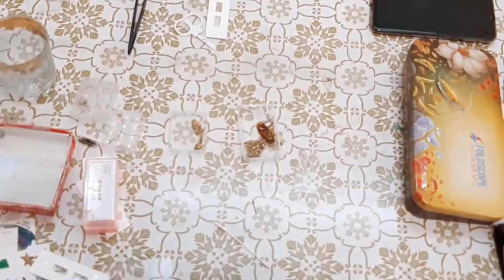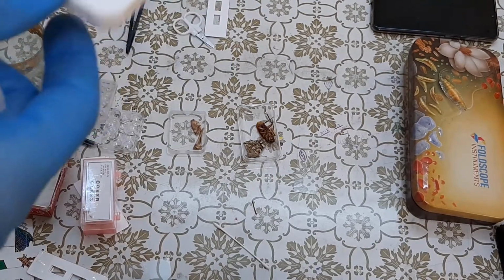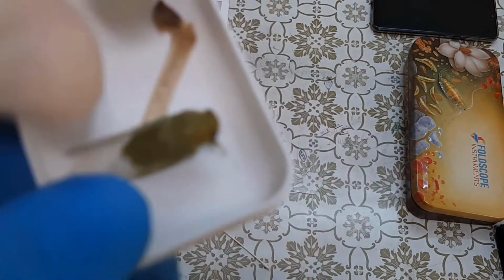By the way, I am using the LED magnifier to show you this one from close. I'm going to flip it upside down to see the head clearly.